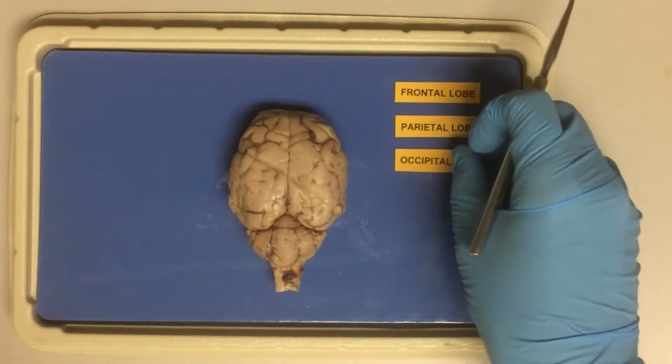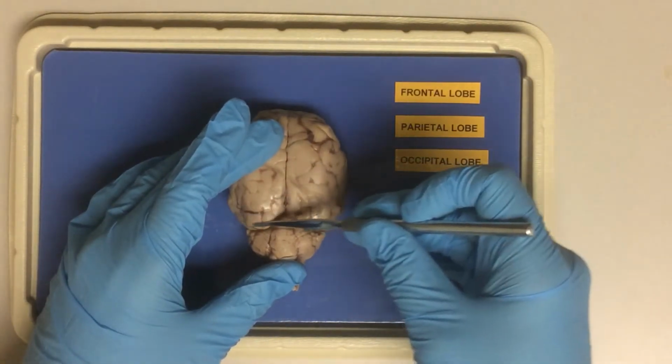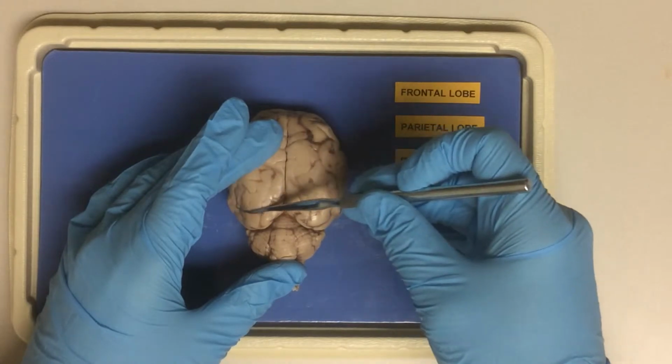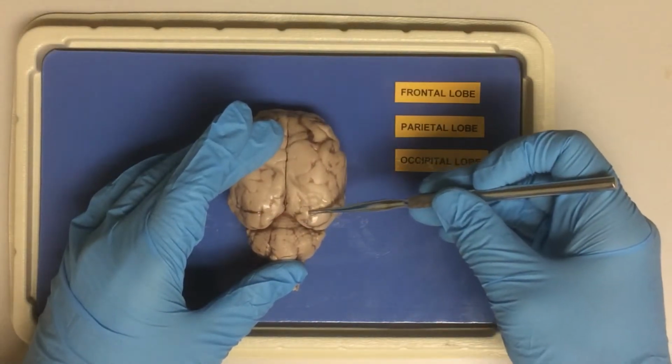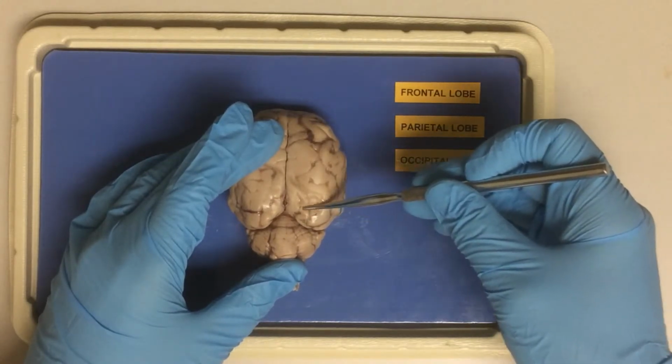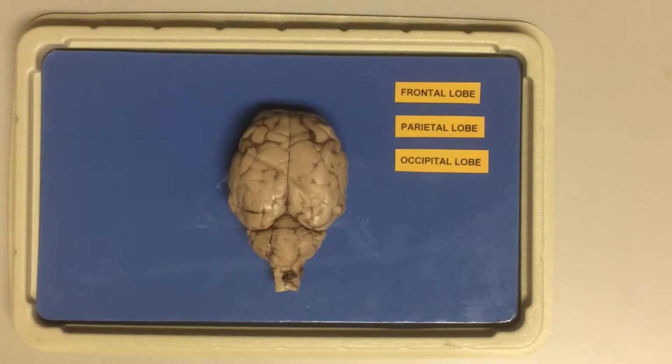And next we have the occipital lobe at the back. This is where visual information is being processed. So we process the information from the eyes as the first point here and give it meaning. Think of hitting the back of your head on the ground. It would be the occipital lobe that takes the most direct impact. And you would be seeing stars. In sheep, this is not hugely large either.